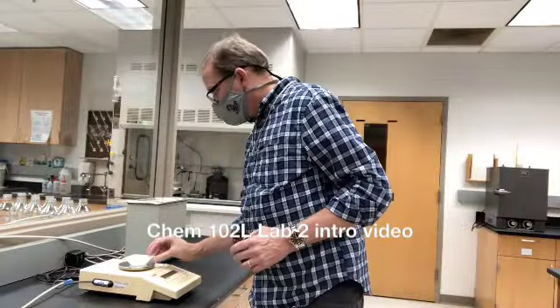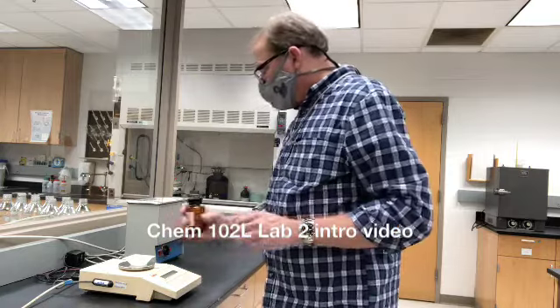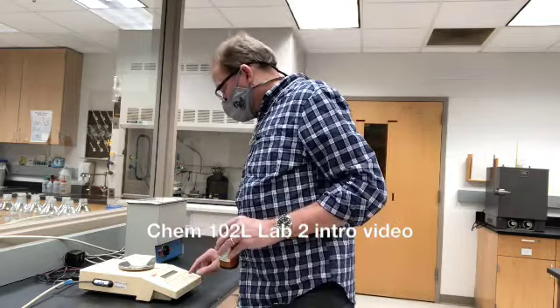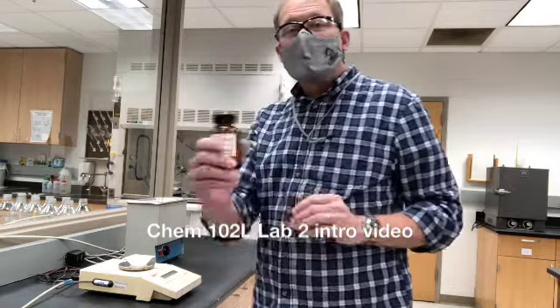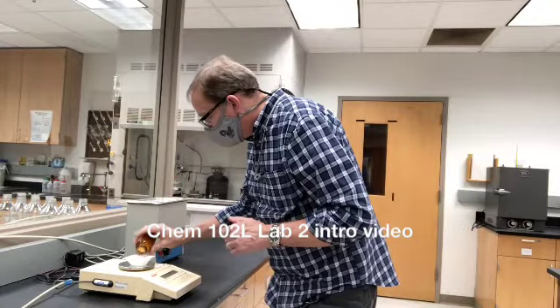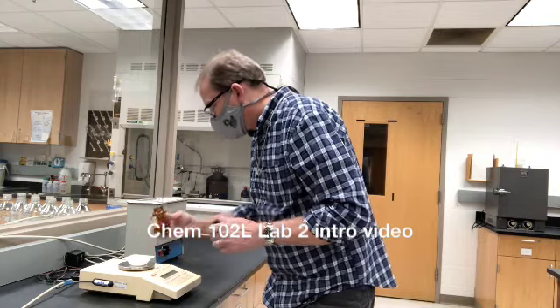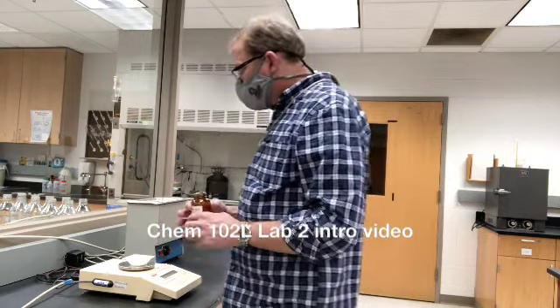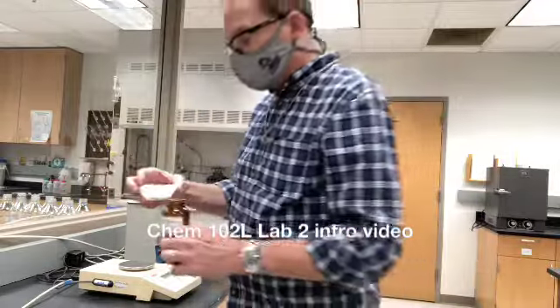So we put this weighing boat on the balance, and we're going to make sure it reads 0. And now I'm just going to get about 4 grams in here. And I can see that it's going up, and it jumped way high. Now that's because a big chunk came out. And that's not what I want. I don't want that big chunk in there.